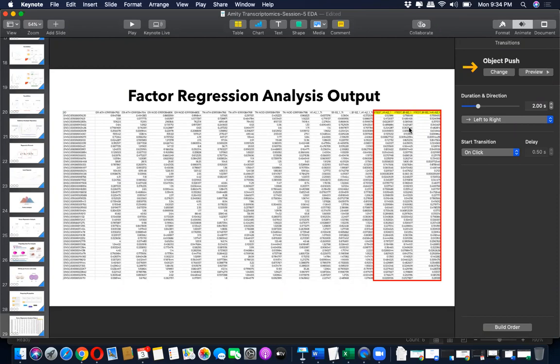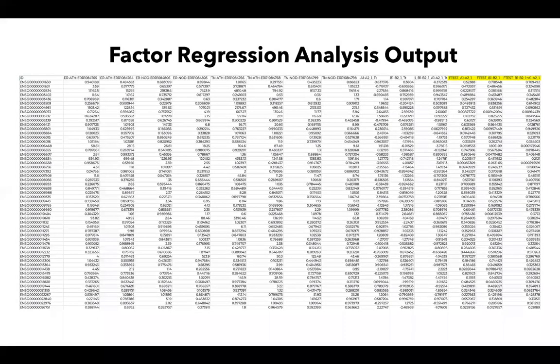And now what you can do is look into this data and start plotting to understand what is in there. The next thing to do after this is to understand how they are biologically important, and what kind of information you can learn from them using this sort of statistics, coming from these genes.